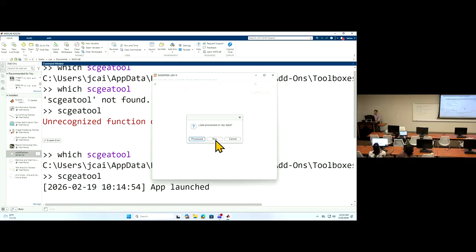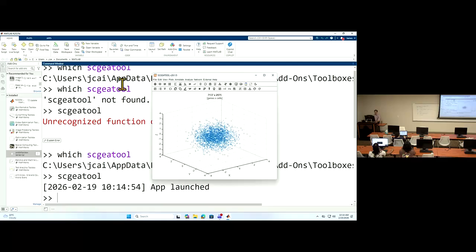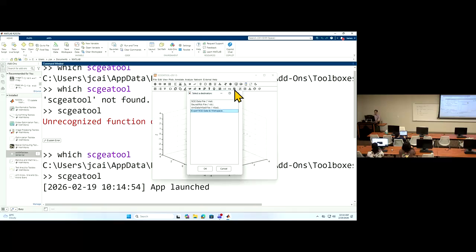So now we can just try to get some data back into the workspace. You can click raw data, then click this button to export the variable into the workspace, because we want to use the workspace to work on the expression matrix directly.